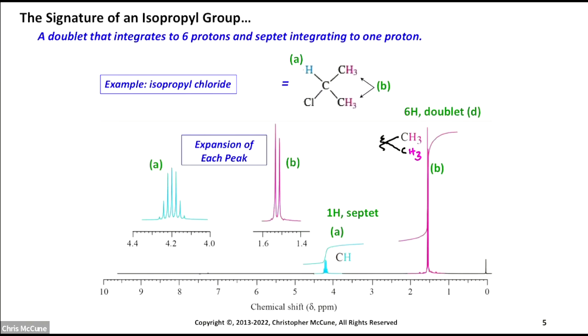Now, in some cases you might see 2 sets of doublets, each integrated to 3, but that then would say that those CH3s are diastereotopic. Here in this particular compound, if you were to replace the hydrogens here with deuterium, and then do it again for here, you'd have a CD3 versus a CD3, and you're going to get enantiomers out of that because you would just create the 1 stereocenter there. So those are enantiotopic CH3s. I'll just write that.